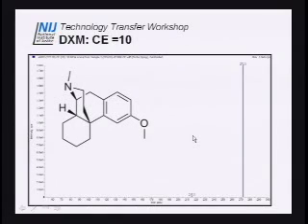So we actually went back after that, and I created a set of slides, which I've used over and over to explain collision energy. What you're going to see here is a series of images of dextromethorphan fragmented at increasing collision energies. And what you're going to watch is a procession of ions move from high to low. So at 10, very little fragmentation, just basically 272, which is right here.